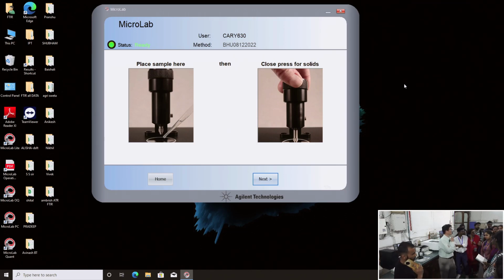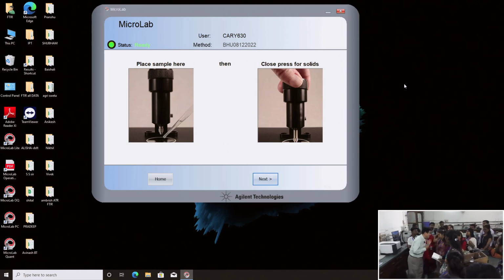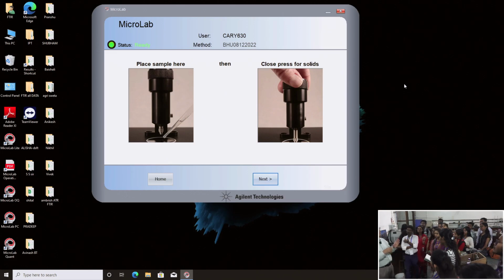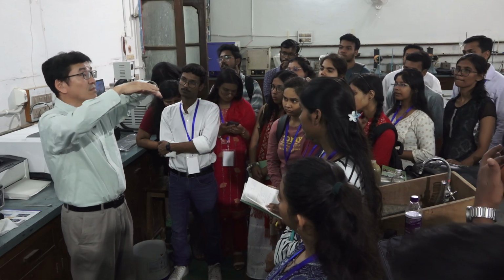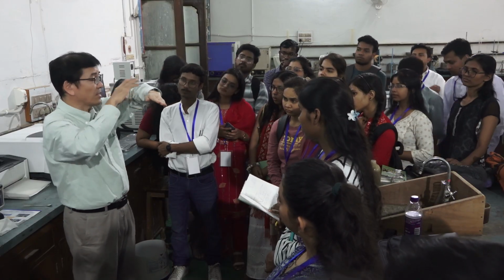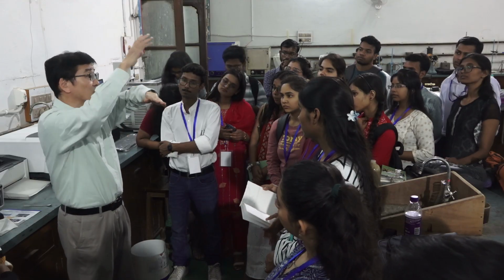Can you please explain a bit about attenuated total reflectance, ATR? What is that? Okay, so here is the interface between some material and air. Typically we use silicon or germanium, Si or Ge, as a prism.